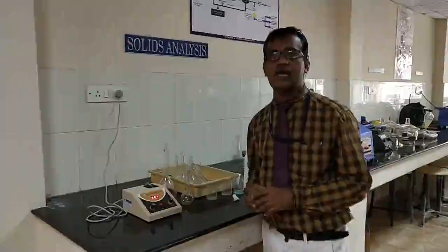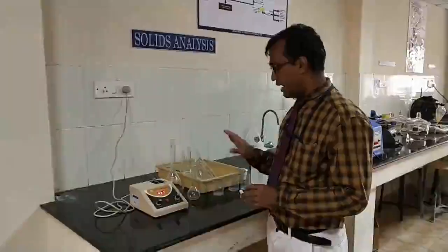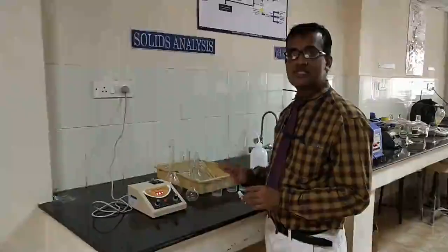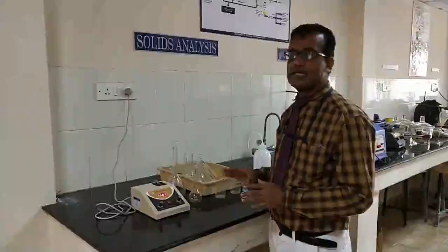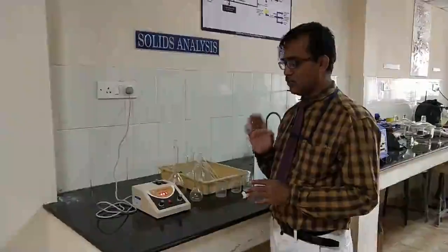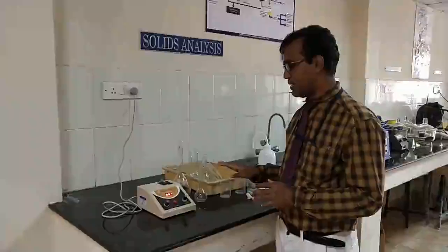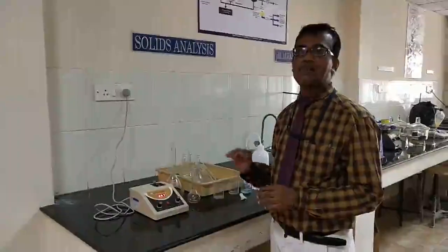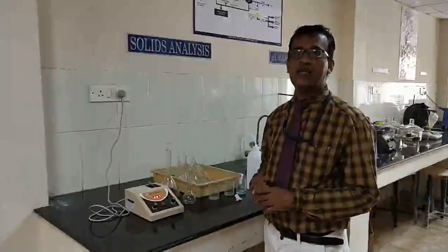In detail, the percentage of transmission of the unknown value and also the percentage transmission of the known values. Then you have to plot the known values against the required concentration in ppm, and by using that graph you can calculate the unknown values. So that will be easier.